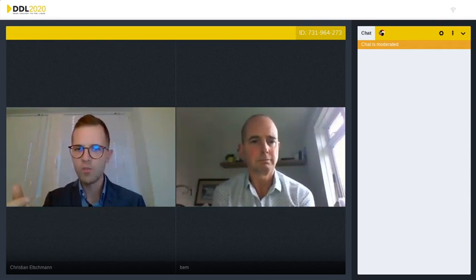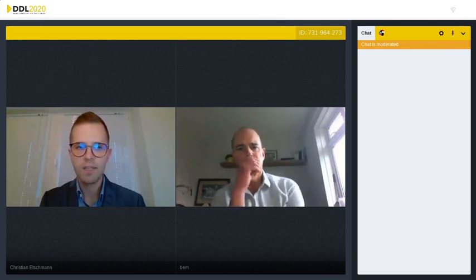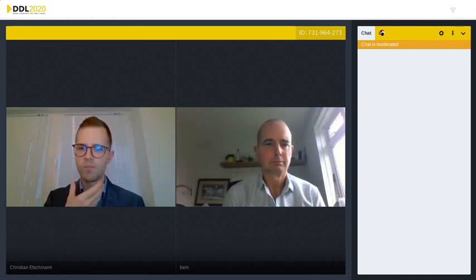I can generate with this method a 20 milligram fine particle dose, but it would be much nicer if the patient did not have to inhale so much powder. So if I can reduce the amount of powder that should be inhaled, it would be better for a patient, because in high dose inhalation, the most observed side effect is cough because of the high powder amount.